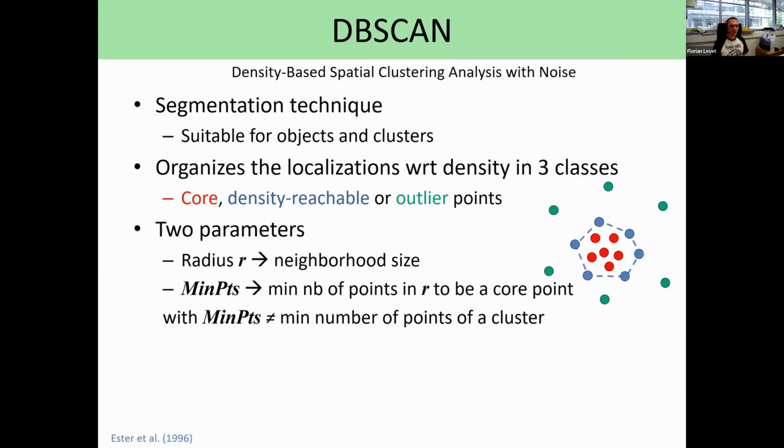And so basically what you can do is use segmentation techniques. In the field, there are basically two big families of segmentation techniques that are used. There is DBSCAN, which is, I think, by far the most used technique, which stands for density-based spatial clustering analysis with noise. So it's a segmentation technique. You can obviously segment objects or clusters depending on your parameters.